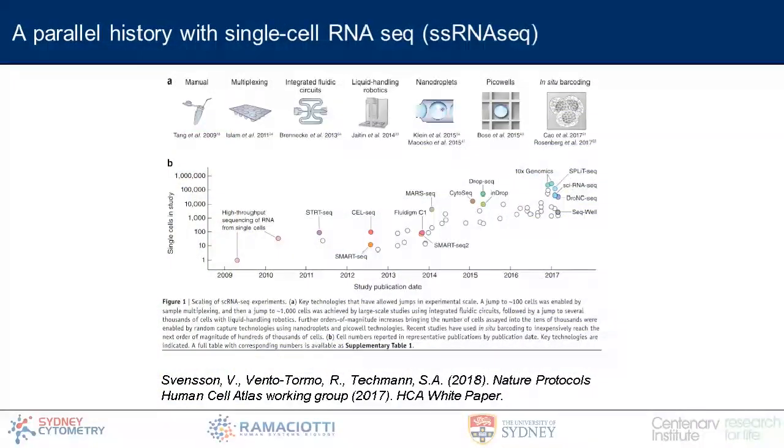And finally, particularly recently with the evolution of projects like the Human Cell Atlas, we've seen a huge scaling of focus and attention towards single-cell RNA sequencing technologies, and in particular, a focus on being able to compare these different technologies and see which is best suited to what kind of application. And some of these have been summarized in some excellent papers over the last couple of years.